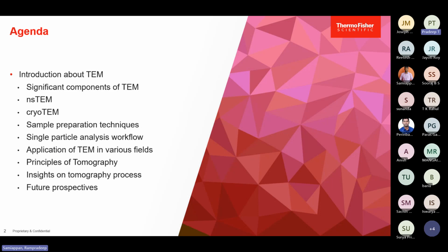And later I will go through the single particle analysis workflow, right from the start until the data collection, and then how the application of electron microscopy works in different fields, be it the pharmaceutical sector or the academic sector. I will also touch upon the principles of tomography a bit, and a few insights about the tomography process, how it is done, and what equipment is used for the tomography process, but not in depth.